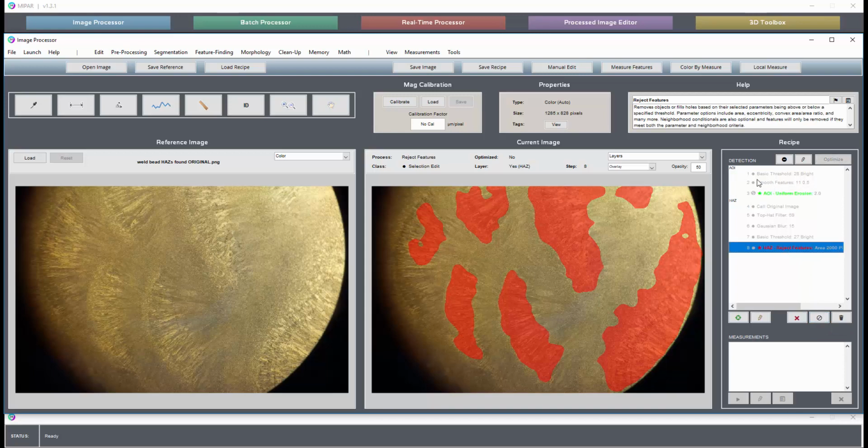And you see that by naming those layers or setting those layers, Mipar has automatically named the associated chapter the same way. So this can be a time saver and an automator in helping you name your chapters according to the layers that they go after. Now, you can always change these names.